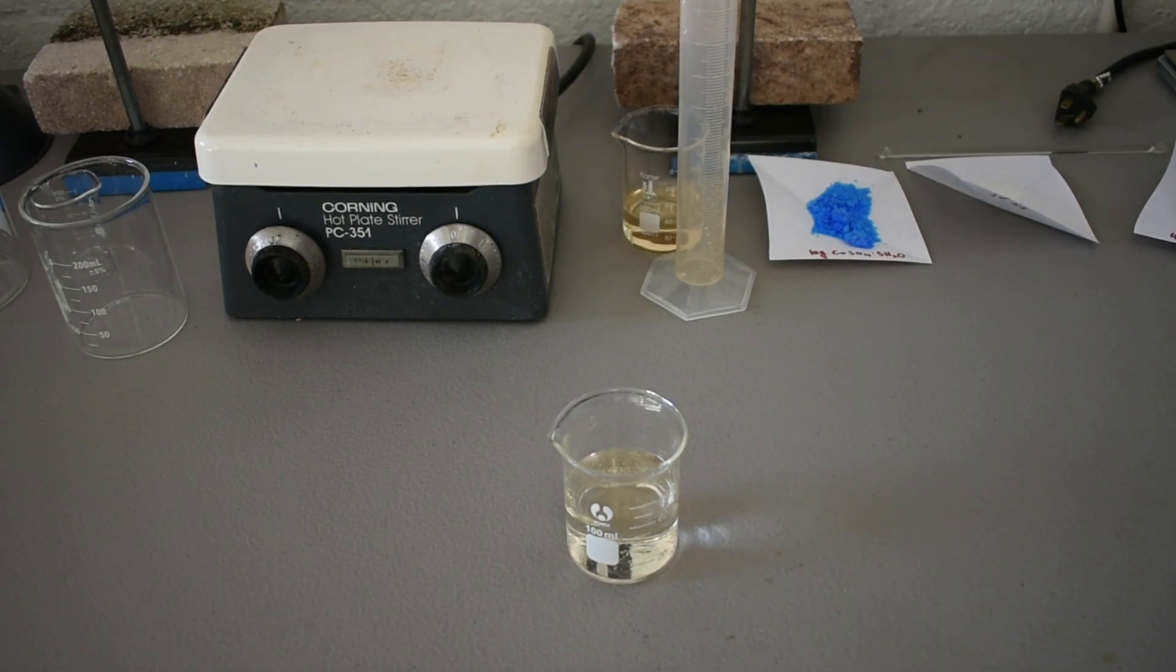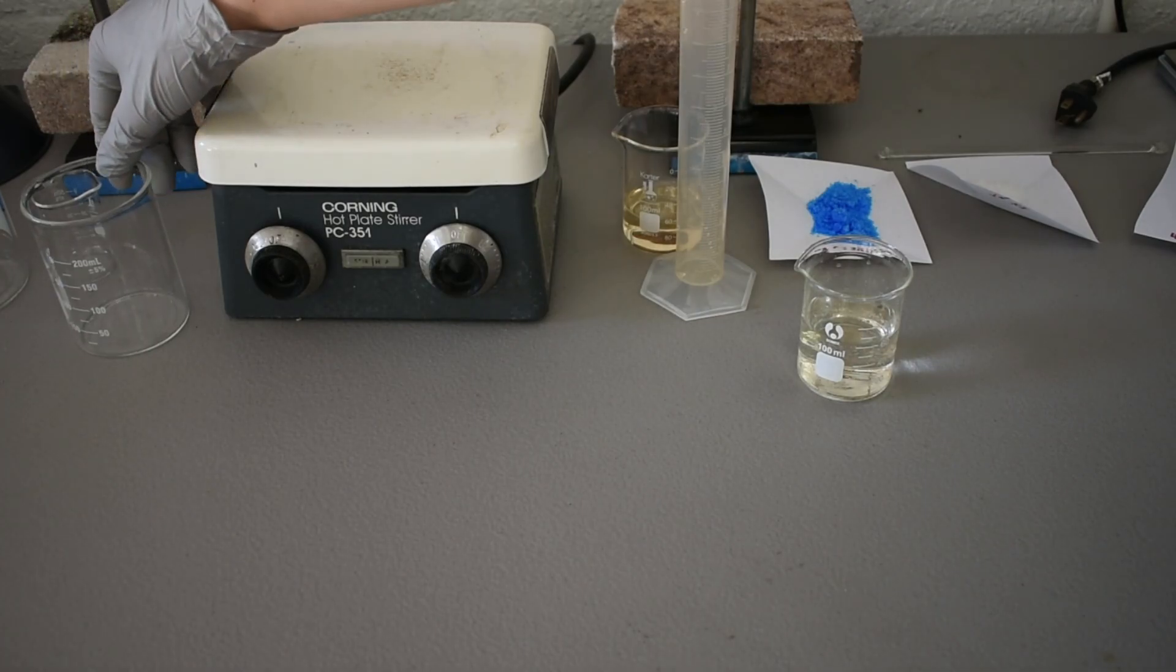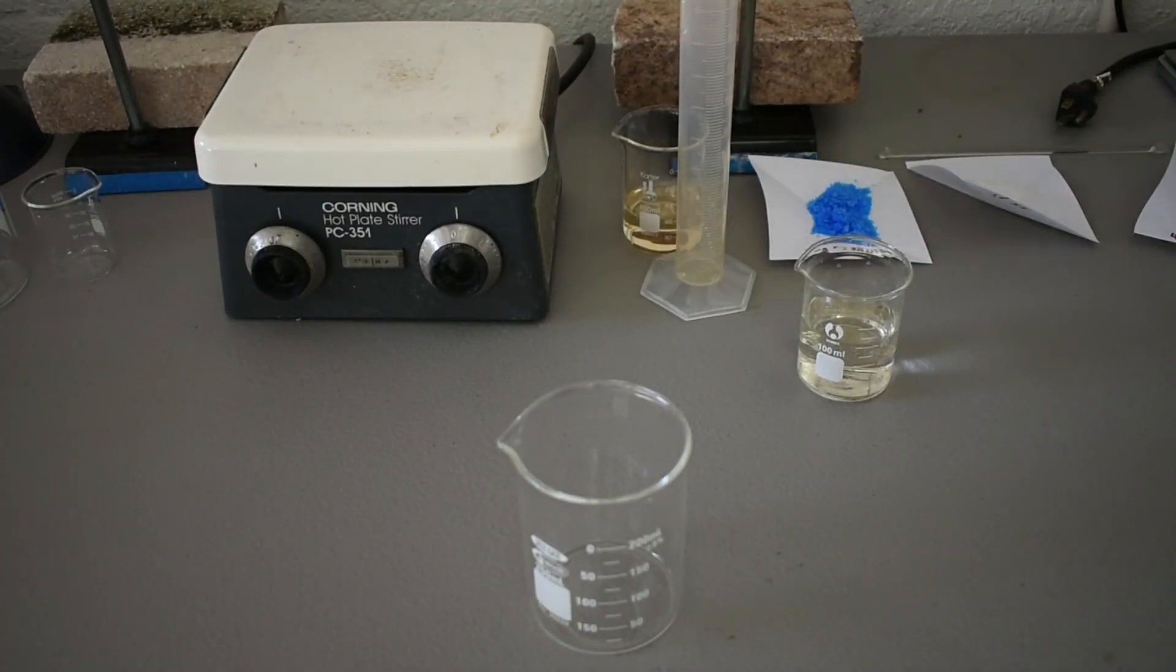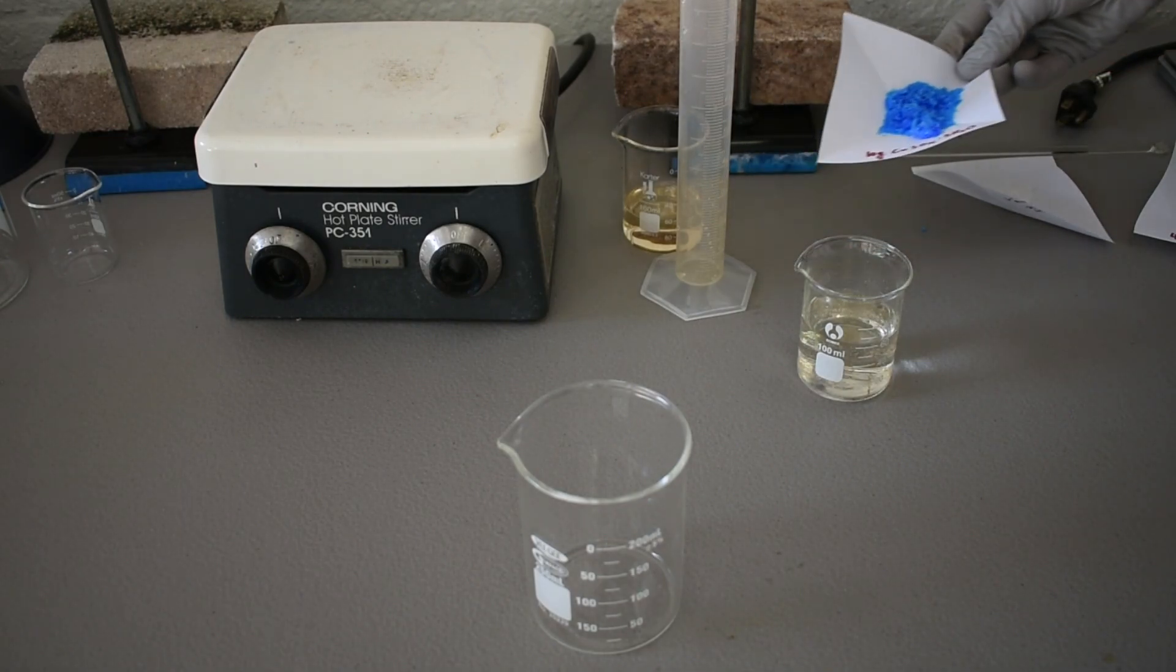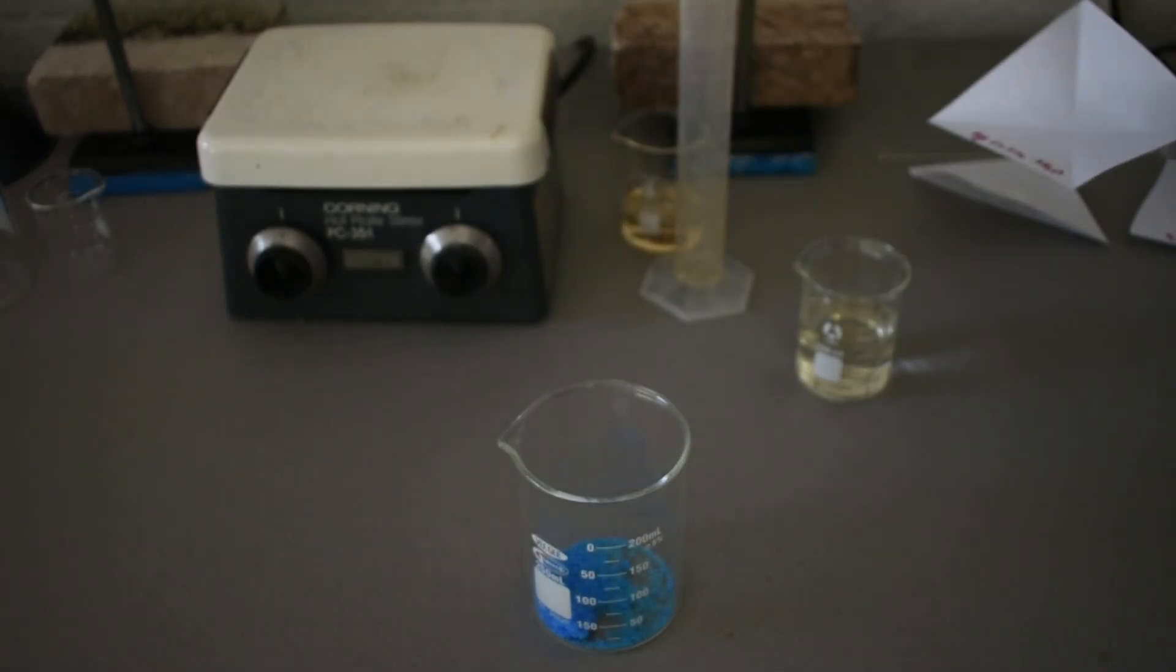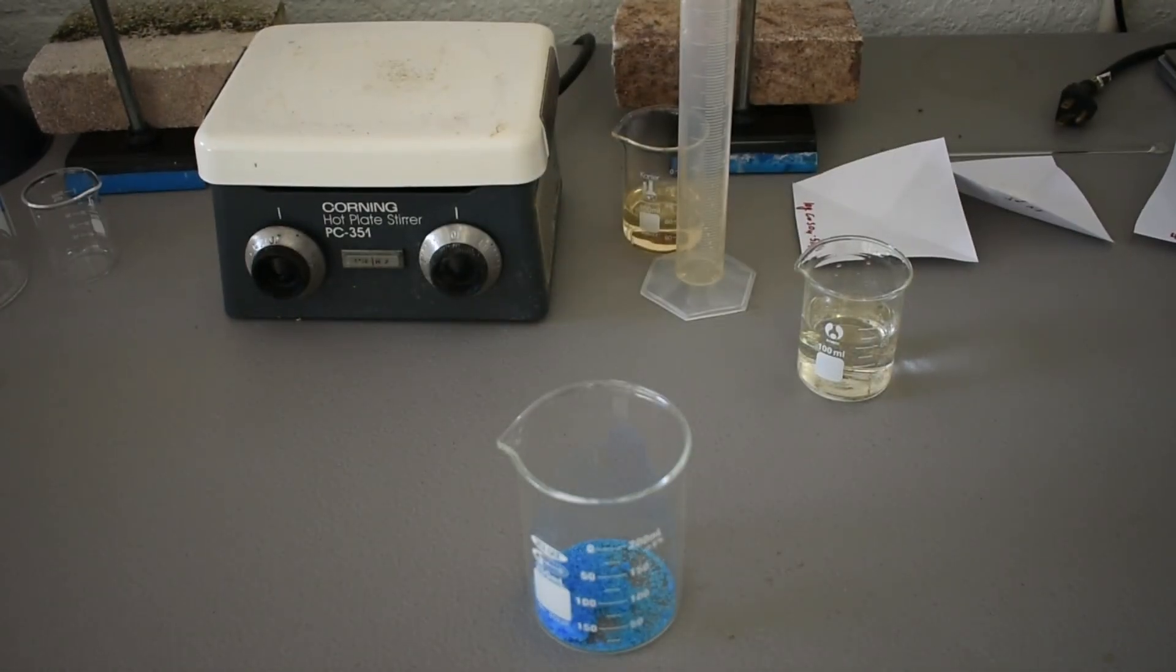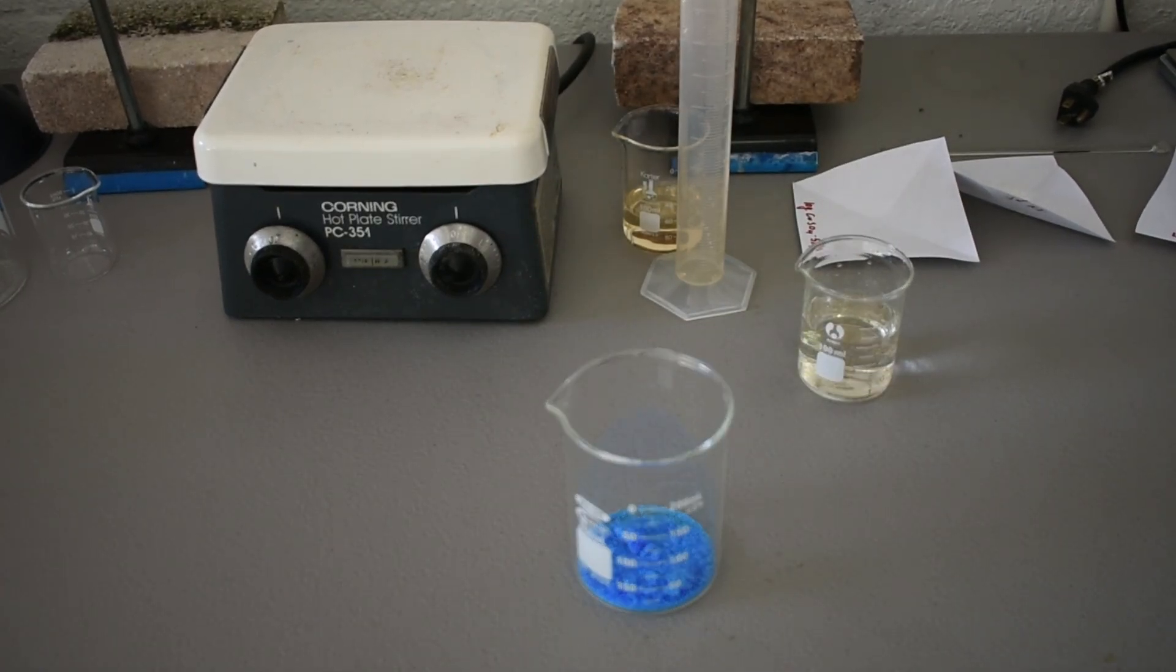Now what we're going to do is prepare a separate solution of the copper sulfate. So we're going to put our 10 grams of copper sulfate pentahydrate, and we're going to dissolve that in an arbitrary amount of water, just enough so it all dissolves.